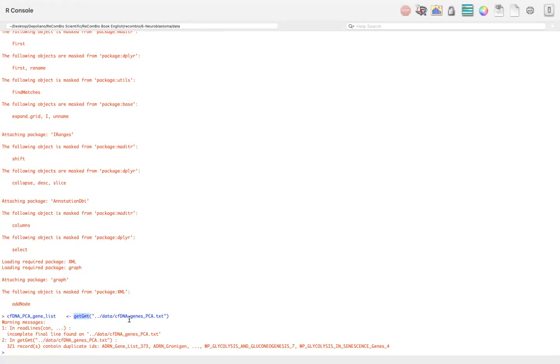It seems like it's finding it somewhere, but I'm going to try to use the absolute path anyways, and I'm gonna see what's gonna happen. This is in a more desktop, Poliano analysis, and then cfDNA.